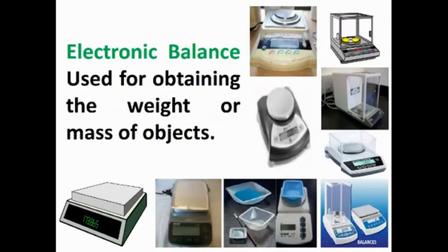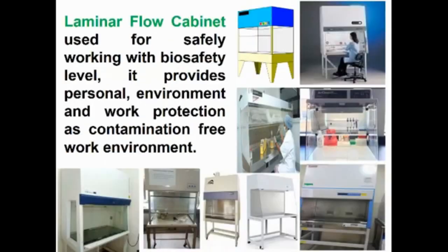Electronic balance, used for obtaining the weight or mass of objects. Laminar Flow Cabinet, used for safely working with biosafety level. It provides personal, environment and work protection as a contamination-free work environment.